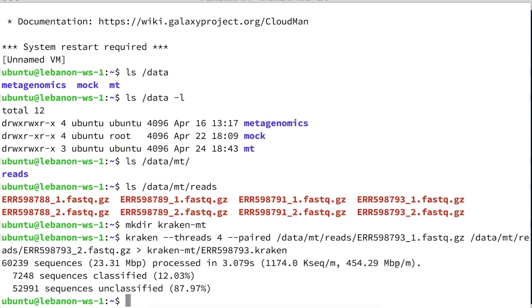Now we are seeing something on screen. This is a reminder that we have two independent channels in the shell. One is called standard output, and with the redirect operator we are sending standard output into a file. But there is also a second channel called standard error, which is not only for errors — it's also for information. In this case, we receive a small feedback about the number of classified and unclassified sequences. The number of classified sequences is quite low, but we could have contaminants or be screening for species not present in our database, so it depends on the setup.